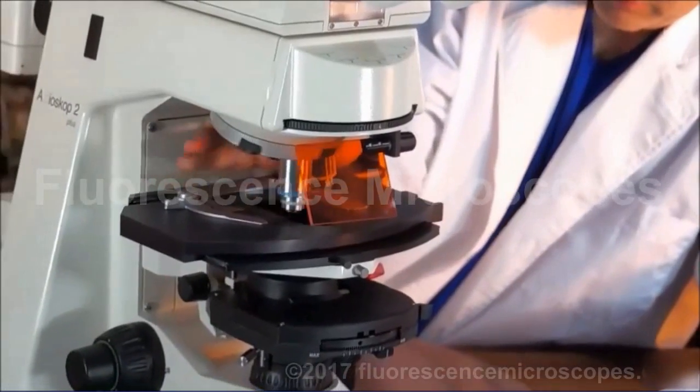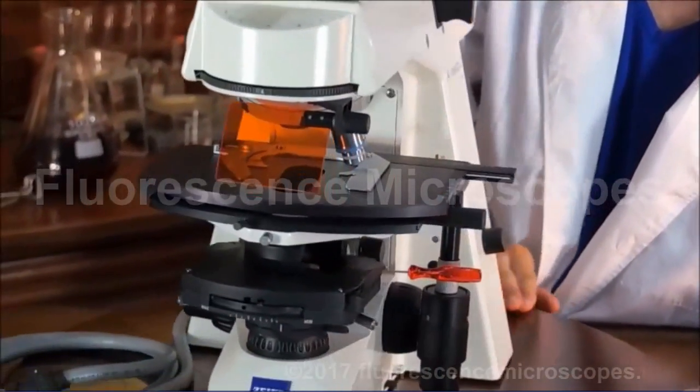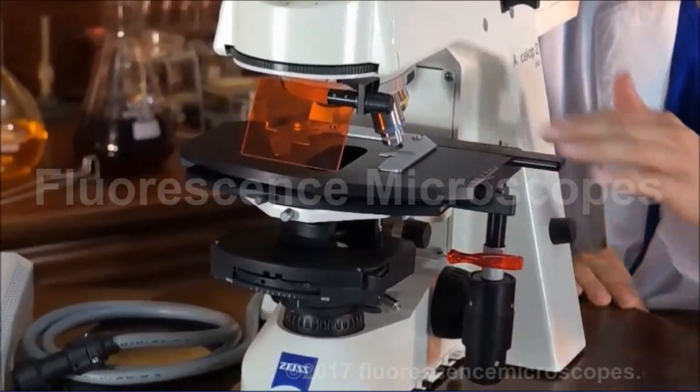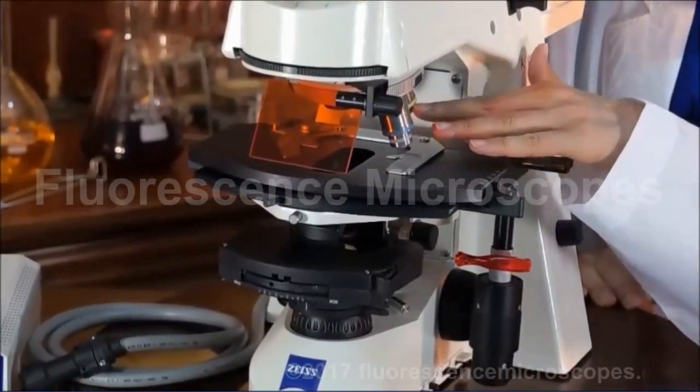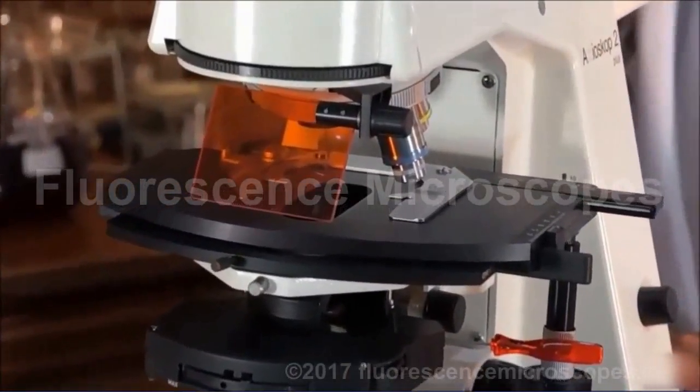Not all these objectives are phase. You'll have to look. Depends on how we configure them too. We can configure this however you may want. Here's a 40X, it's a phase 2. Here's a 10X phase 1. It's got the green lettering in it. It actually says that it's a phase.